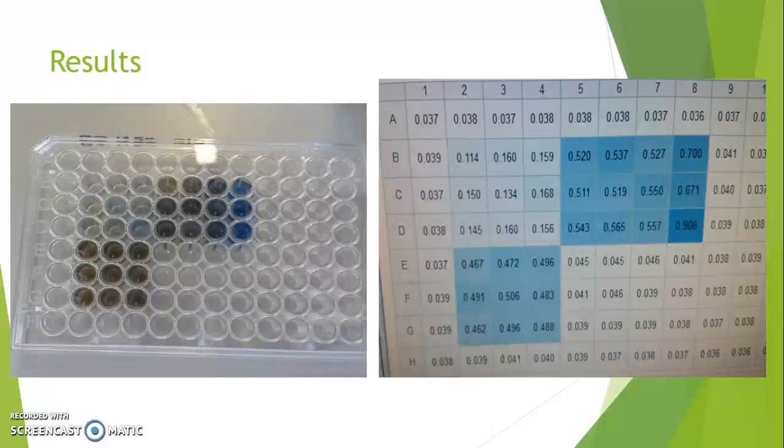Now I will discuss the results. On the left is the Bio-Rad assay, and on the right is the readout result. In the Bio-Rad assay, an initial error occurred in loading. So here are the initial concentrates loaded, and then up here it follows on up until higher concentrations.